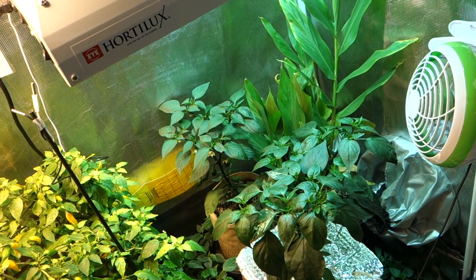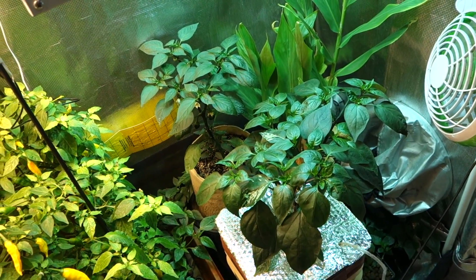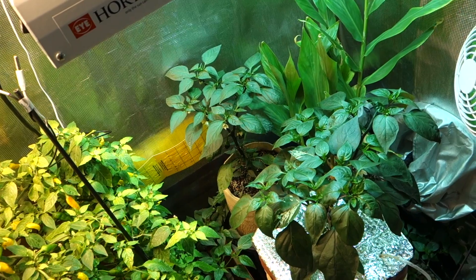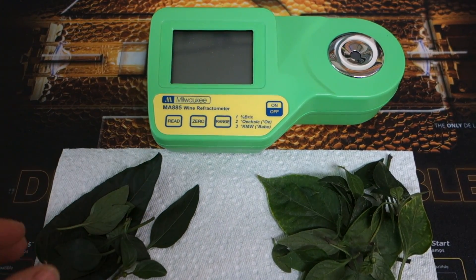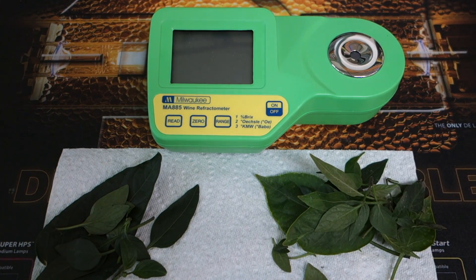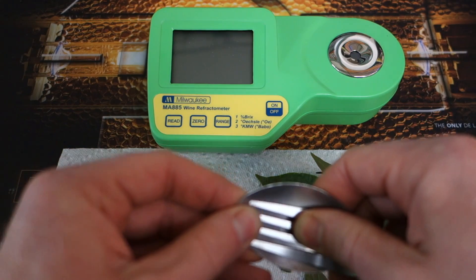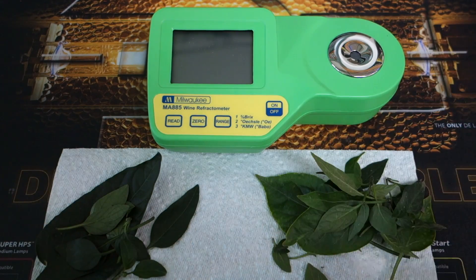We're going to take samples from both and squeeze out the juice using a garlic press. I'll give you some tips on how to improve your Brix using organic biostimulants or adjusting the minerals in your nutrient solution. On the left we have our hydroponic leaves, taken from the bottom of the plant, and on the right are the organic. We'll use a spoon and fork to squeeze a drop of each. If you have a garlic press that's probably most convenient, but I'm going to use these and get a reading of each, then go over some ways to adjust the Brix.